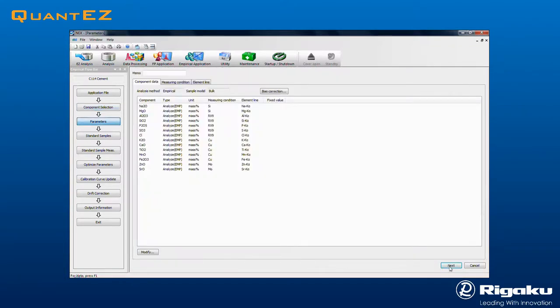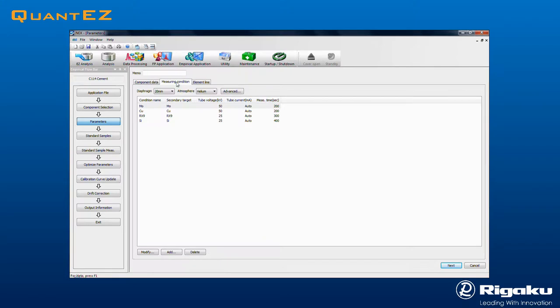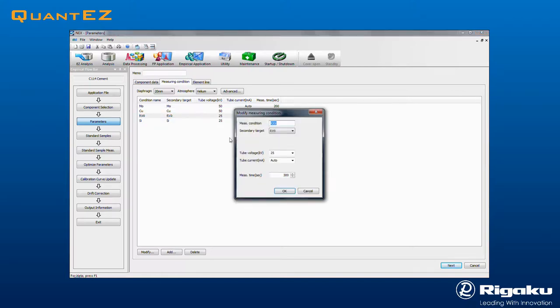Clicking Next brings up the Parameters screen, where measurement conditions and line assignments are automatically set for every component. Tube voltage and current are set automatically. As demonstrated, only the measurement times for a given condition might need to be modified.